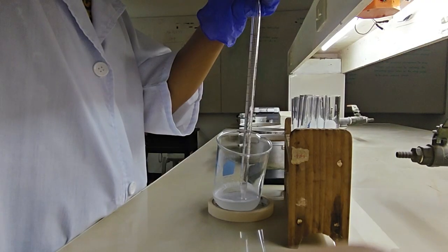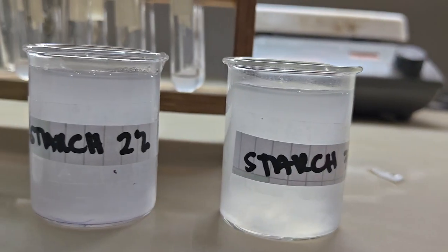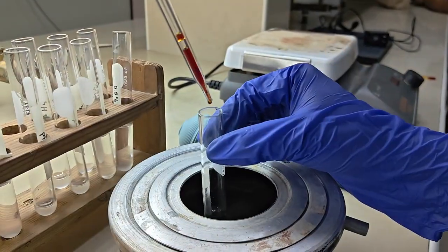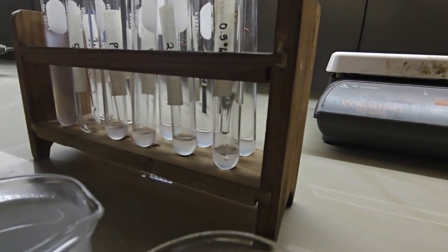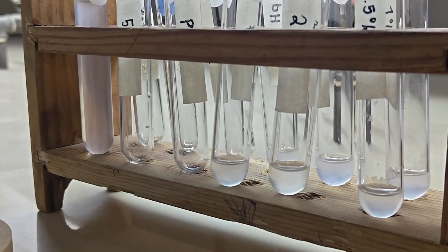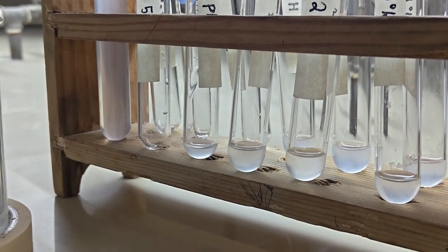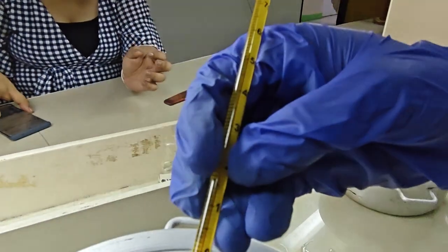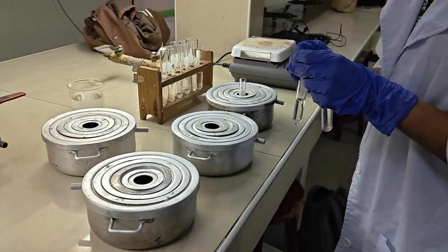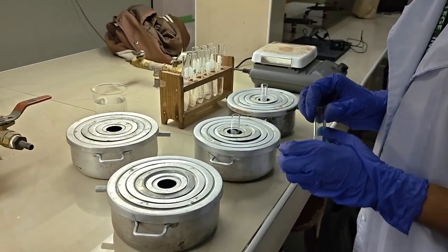The materials used in this experiment include filtered fresh saliva sample, 1% starch solution and other starch concentrations, iodine solution or IKI, buffer solutions at pH 4, pH 7, and pH 9, test tubes and test tube rack, pipettes or droppers, stopwatch and thermometer, ice bath at 5 degrees Celsius, room temperature set up at 25 degrees Celsius, warm water bath at 37 degrees Celsius, and hot water bath at 60 degrees Celsius.